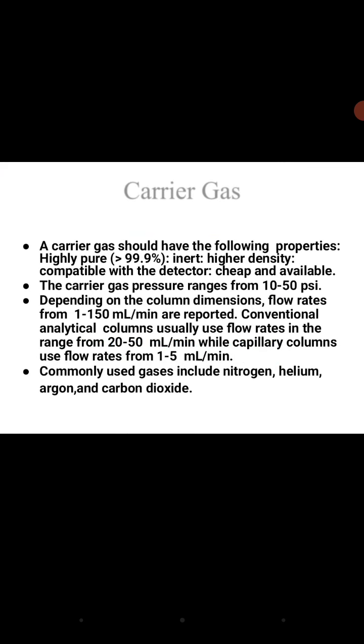Carrier gas. A carrier gas should have the following properties. It should be highly pure, inert, higher density, compatible with the detector, cheap and available. The carrier gas pressure ranges from 10 to 50 psi. Depending on the column dimensions, flow rates from 1 to 150 milliliter per minute are reported.